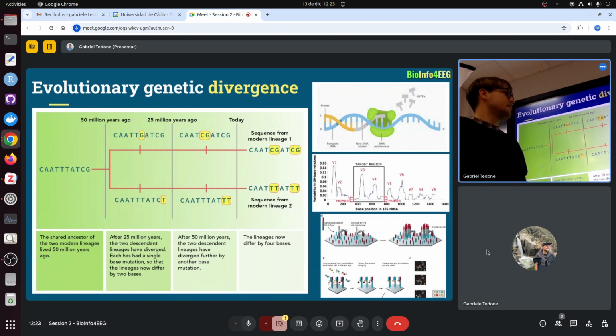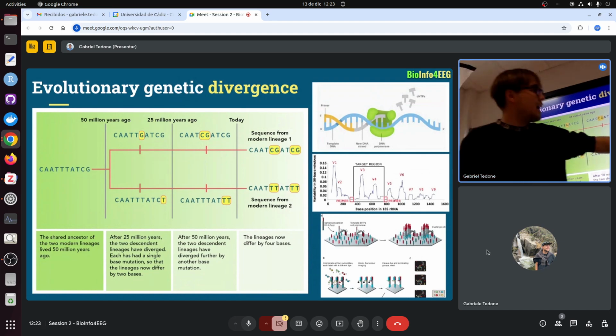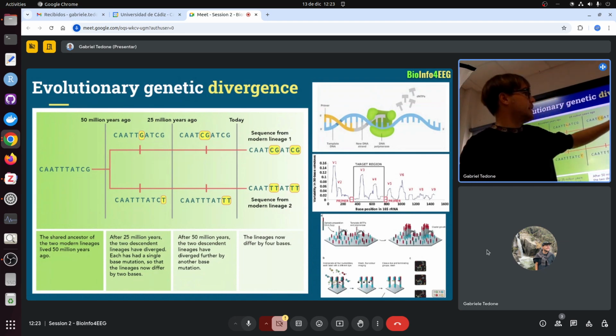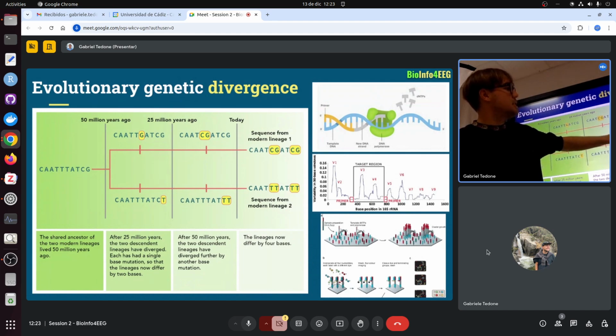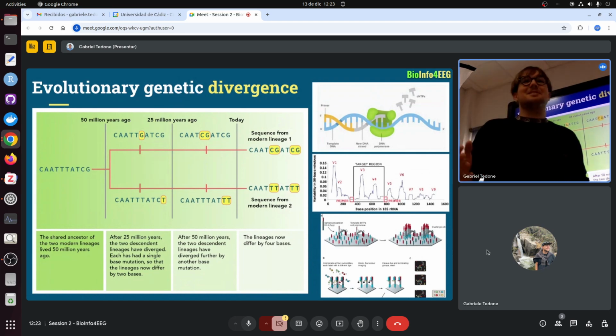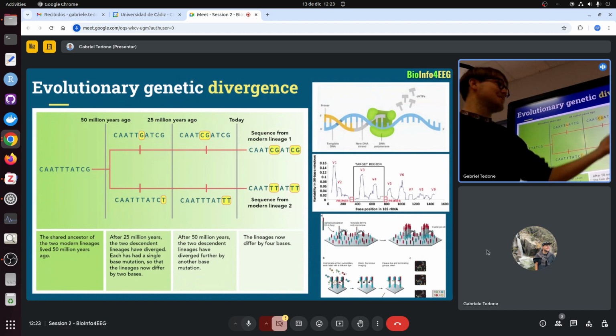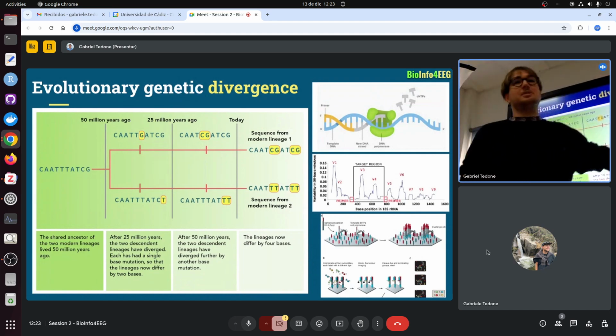It is also why we look for those hypervariable regions in barcodes, which will tell us, okay, this sequence is different from these sequences, because in this region, we see there are differences between species. The problem is the same molecular machine that enables biodiversity and life is also the one we use for sequencing.